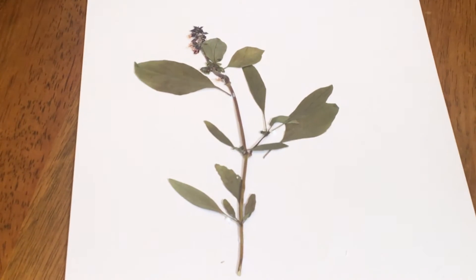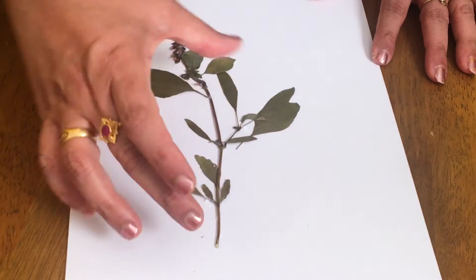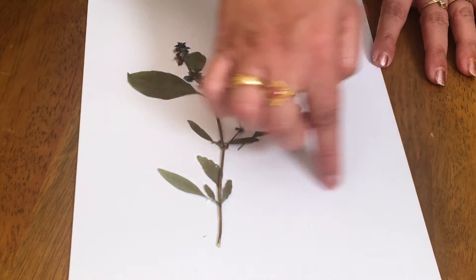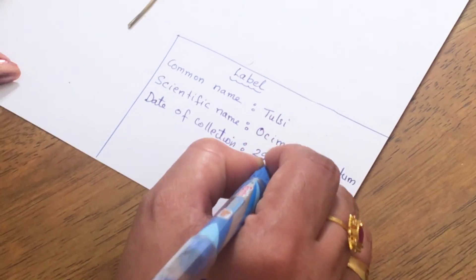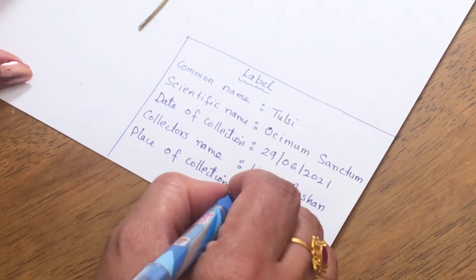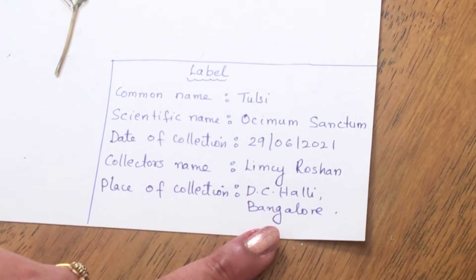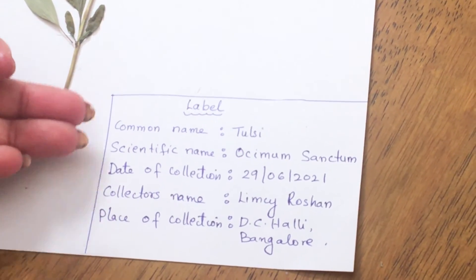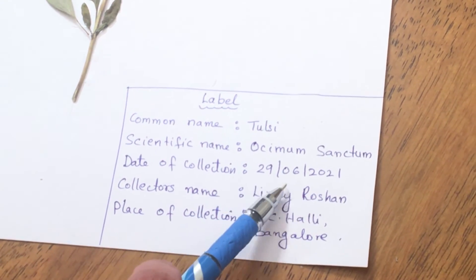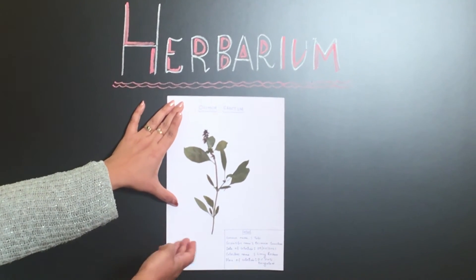This is how we can make a herbarium, but the work is not yet over. The herbarium also has a few details in the form of a label. When you paste the plant specimen, make sure there is some space to label the plant. You can write whether it's a herb, a shrub, dicot, monocot, and other details. Mainly you will be writing the common name and scientific name. The common name of this plant is Tulsi; scientific name is Ocimum sanctum. Date of collection: 29 June 2021. Collector's name: me. Place of collection: DC Hulli, Bangalore. This is how we can prepare a herbarium at home.